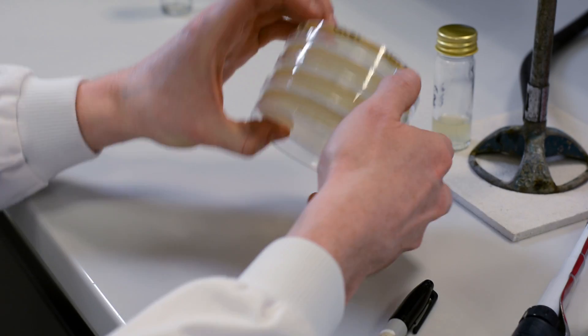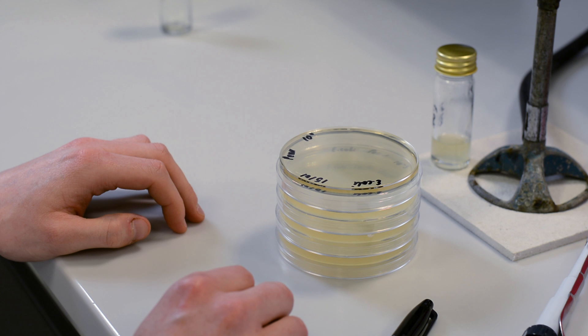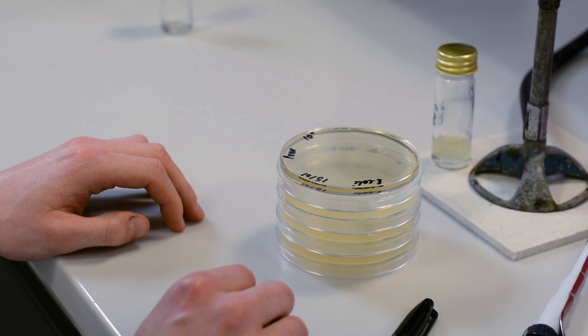While this method allows for growth of anaerobic as well as aerobic bacteria, any obligate aerobes which end up within the agar will not grow.